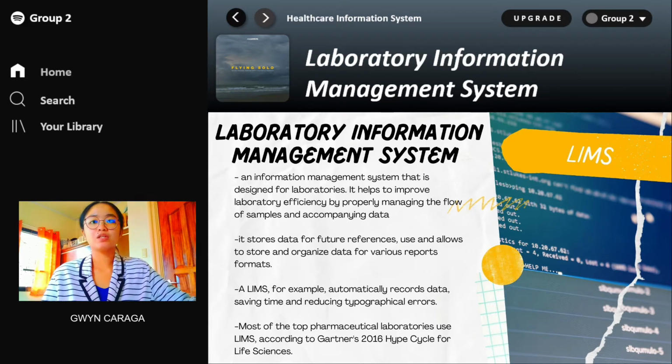It allows us to store and organize data for various report formats. A LIMS, for example, automatically records data, saving time and reducing typographical errors. That is how useful LIMS is. And according to Gartner's 2016 Hype Cycle for Life Sciences, most of the top pharmaceutical laboratories are using LIMS.